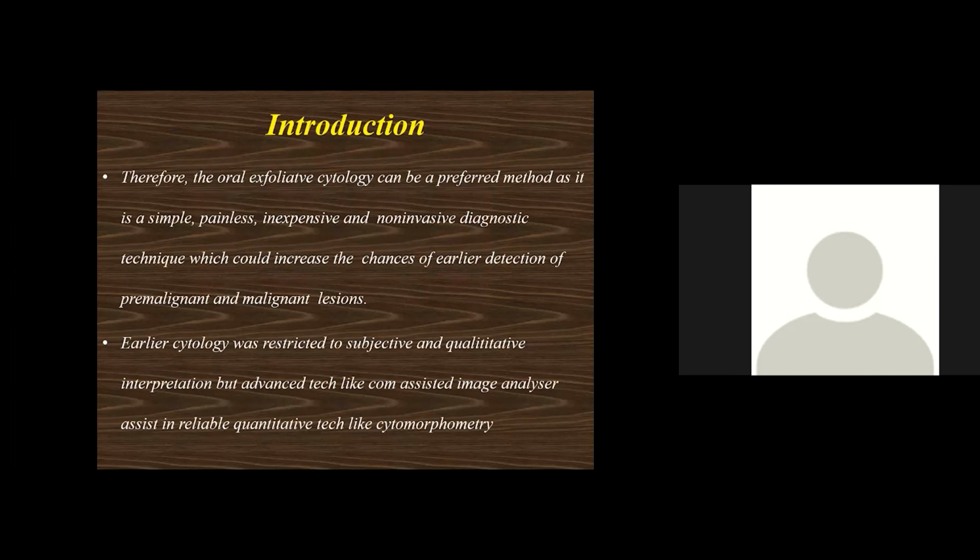we tend to use some simple, painless, inexpensive, and non-invasive diagnostic technique, which includes exfoliative cytology, which is also used nowadays, but earlier it was used mainly for the vaginal smear. So similarly, for oral cytological smears, we have used the oral exfoliative cytology procedure, which could increase the chances of earlier detection of pre-malignant and malignant lesions.